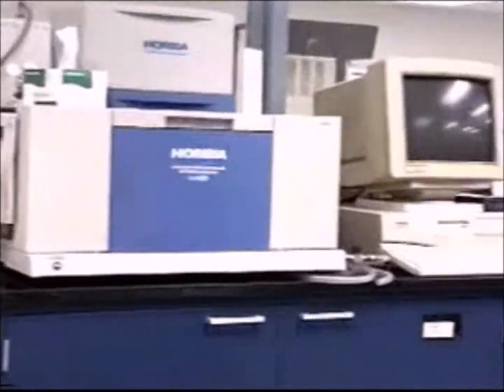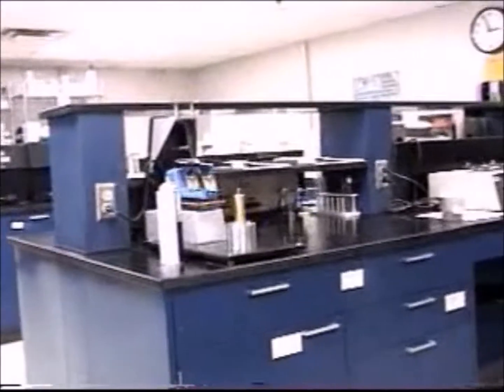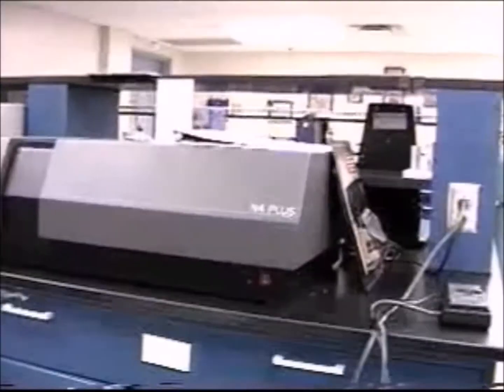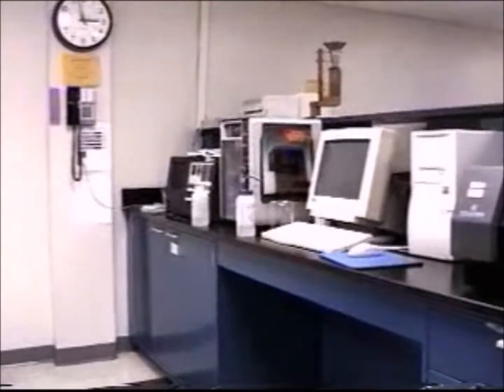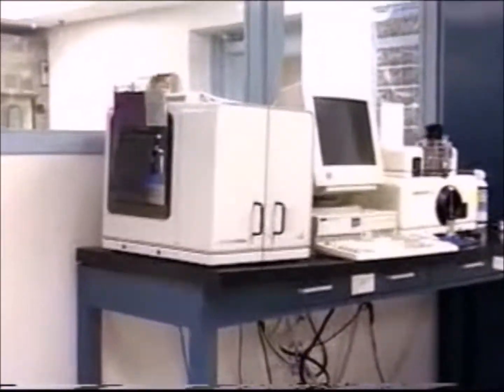It can analyze powders dispersed in a liquid or powders dispersed in air, and runs on the principle of laser scattering. Other equipment shown includes rifflers, tap density, surface area, and balances for weighing. Nanopowders are characterized using Brownian motion. Other methods include electrical zone sensing, laser scattering, which can use ultrasonics to help break up powder agglomerates, and the time of flight particle sizing method.